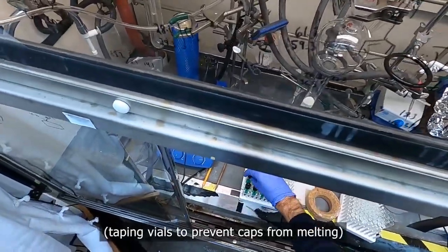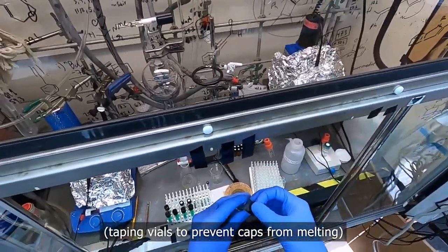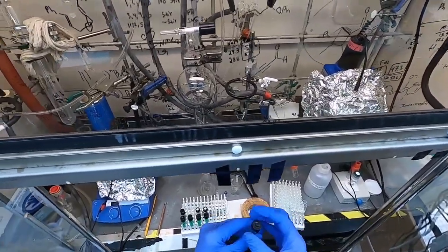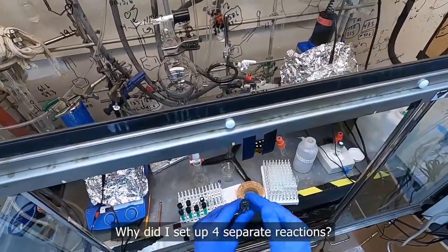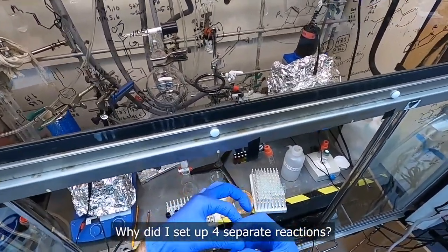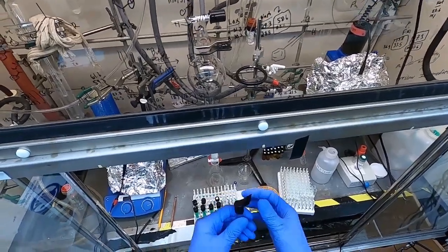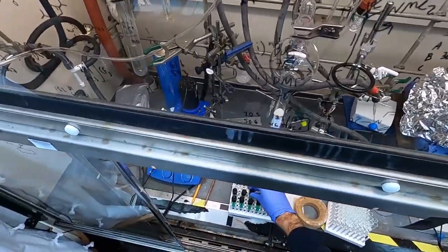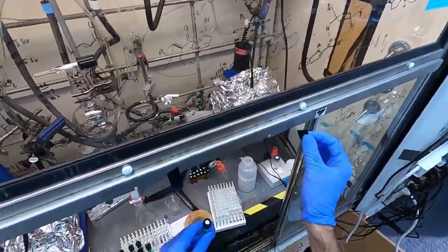Now you might be asking yourself, Sam, you're doing an isolation. Why did you set up 4 different reactions for the substrate? The reason I set up 4 is because one of them is going to be my analysis reaction. And what I mean by that is, that's the reaction that I'll quench with water, and I will analyze it by NMR. I will take TLCs, and I'll use that as my throwaway reaction to assist in the isolation of one of the other ones.